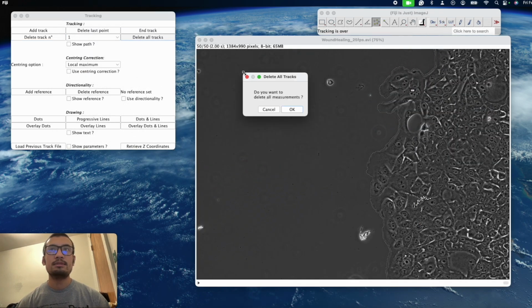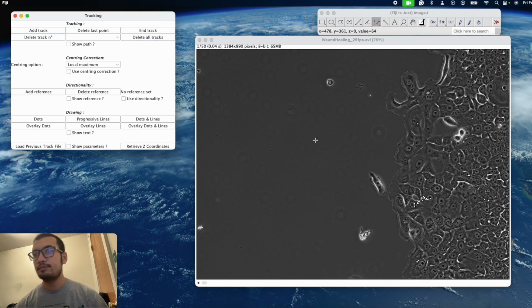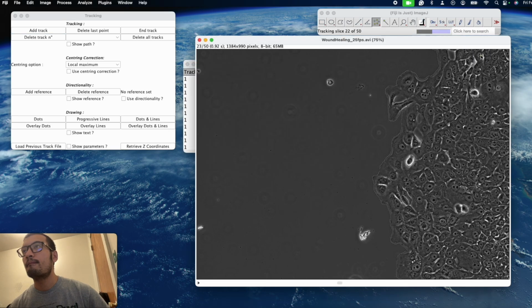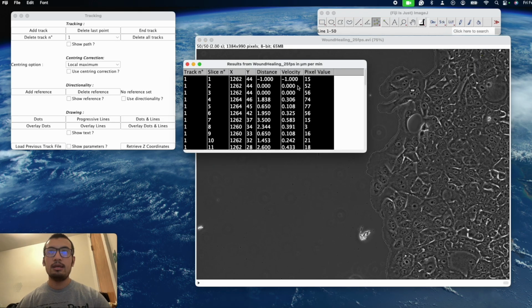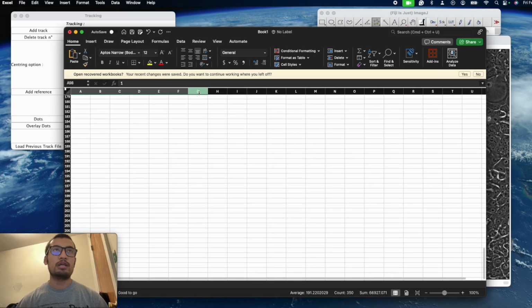So delete all tracks, add track, so I'm going to track one more particle here.